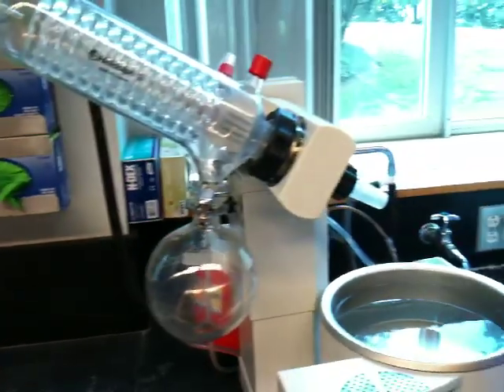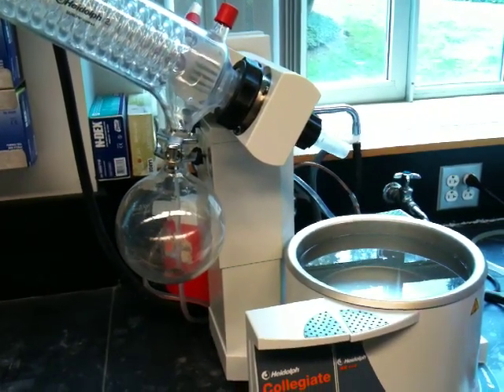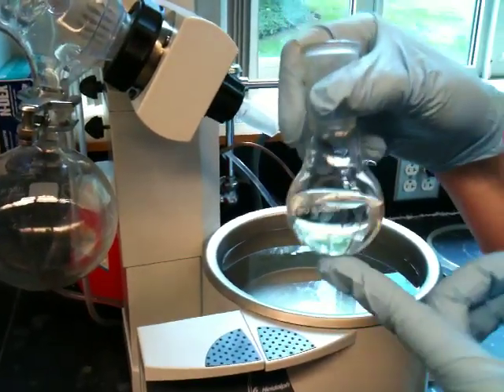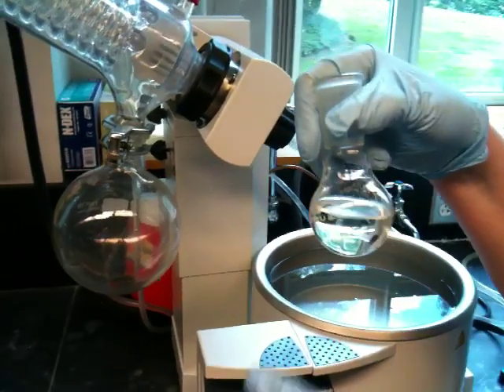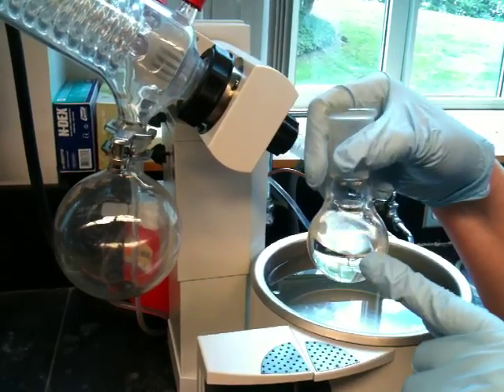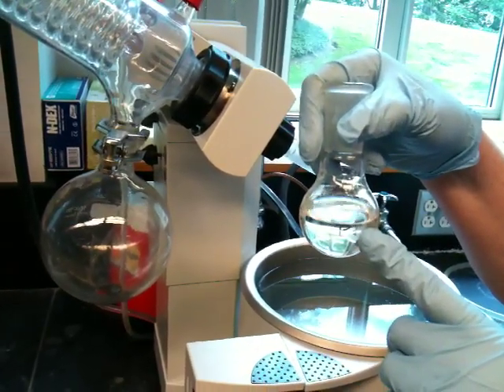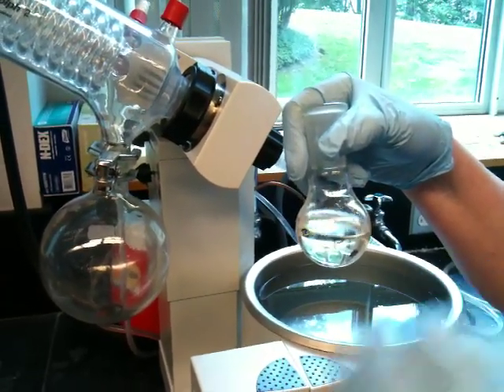This is really a distillation apparatus. What it's designed for is the rapid removal of solvent from a sample that contains a solid or a very high boiling liquid. You use rotary evaporation when you want the solid or you want the high boiling liquid, and you don't want the solvent. At the end of your lab, you're going to have a solution of dichloromethane holding mostly caffeine and a little bit of chlorophyll, which comes out of tea leaves.